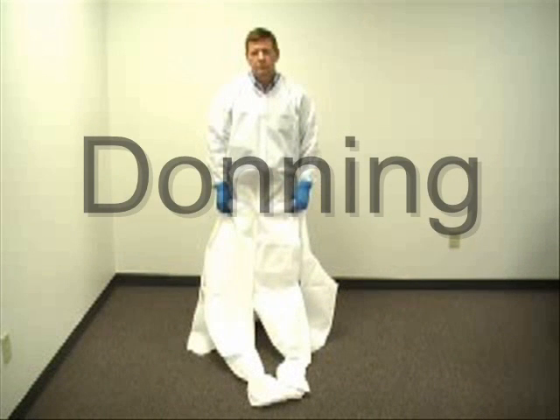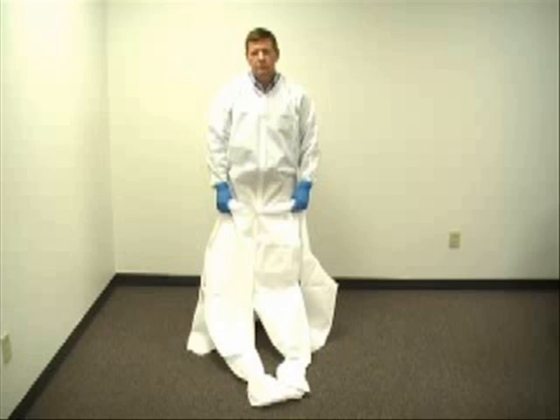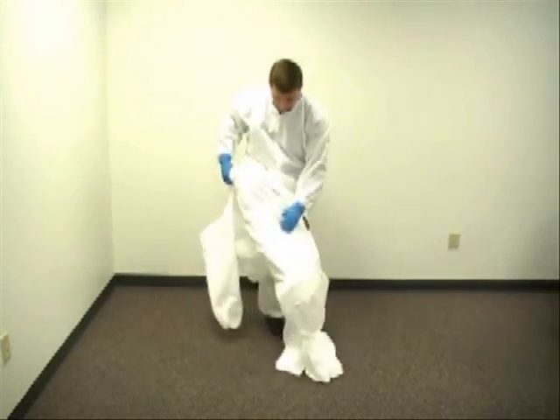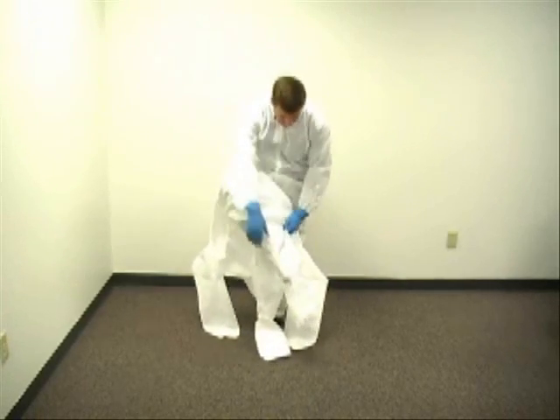Instructions for donning the Q-Guard Quantum Wear Suit: To don the suit, insert the feet into the boots of the suit and pull the garment up to insert the arms into the suit. Pull the zipper to full closure.